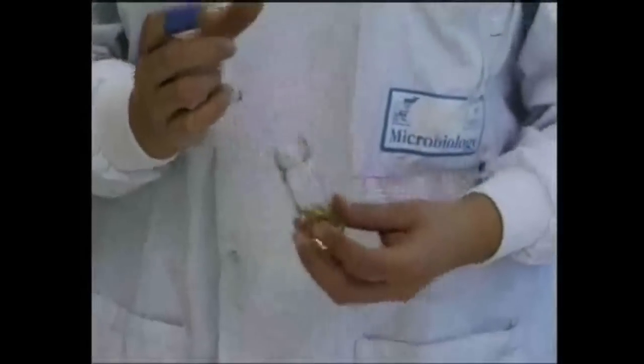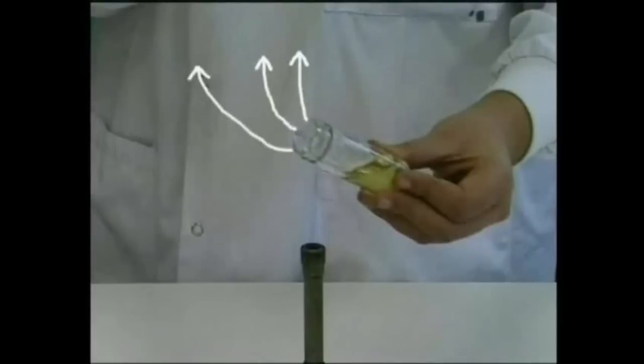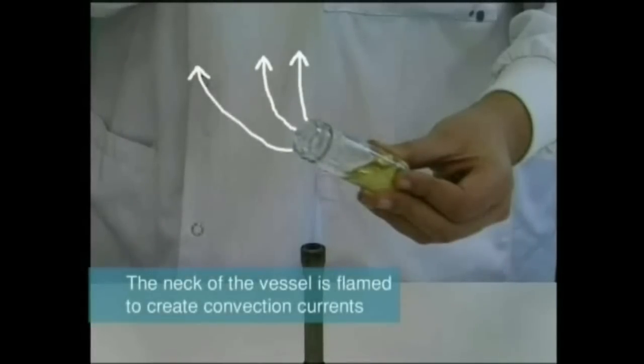Bottles and other containers are always flamed by holding the neck briefly in the flame. This does not sterilize, but creates convection currents around the neck which lift the air out and remove any microorganisms suspended in the air around the top of the container. This helps reduce contamination.